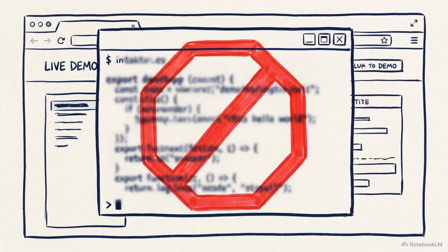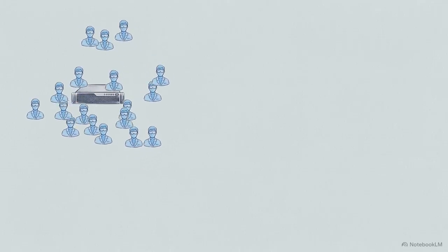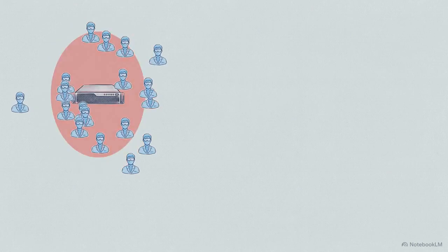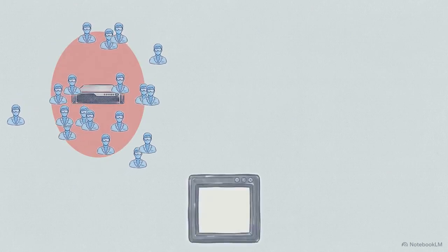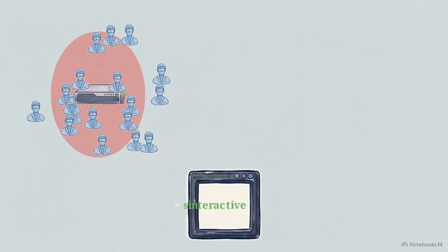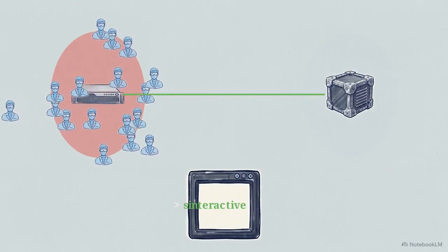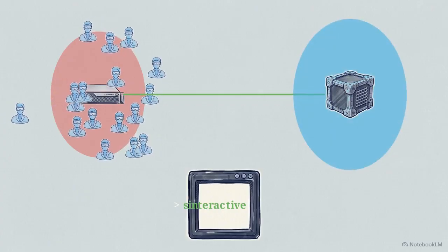Once you are in, stop. Do not run any analysis right here on the login node. This is a shared entryway for hundreds of researchers, and running intensive processes here can slow the system for everyone. Instead, we move to a private workspace. Type the command sinteractive and hit enter. This command secures a dedicated compute node, giving you the resources needed to run your tools.